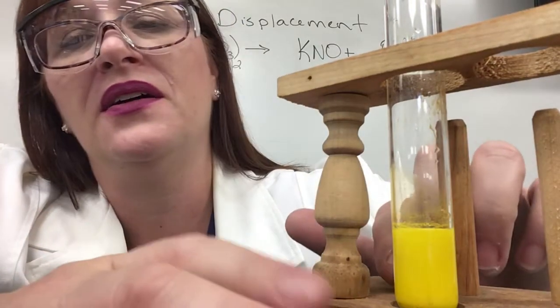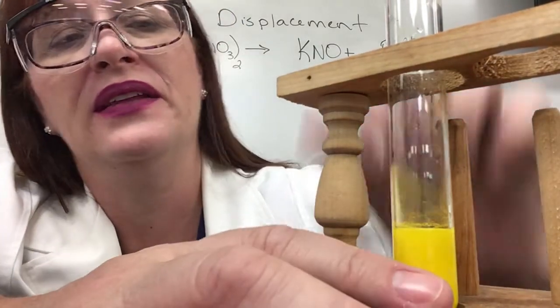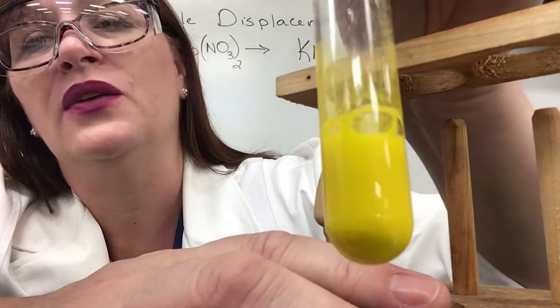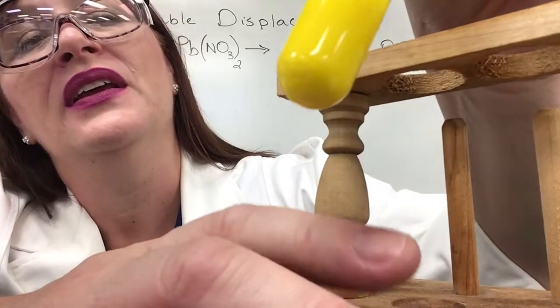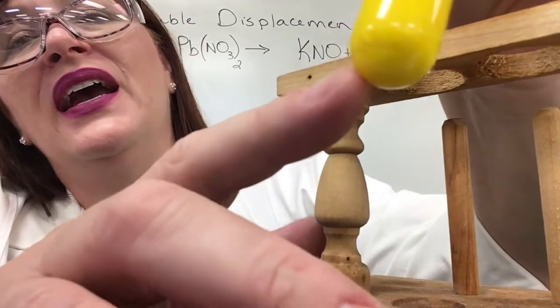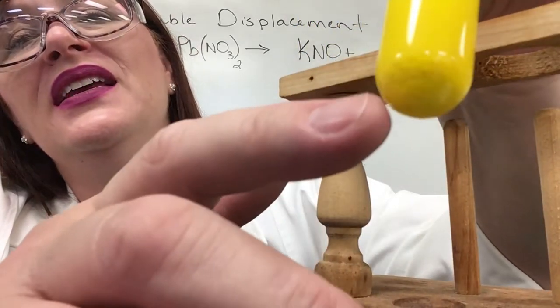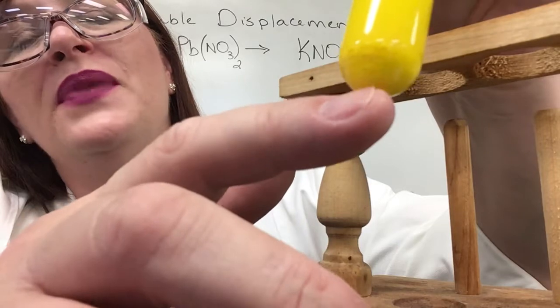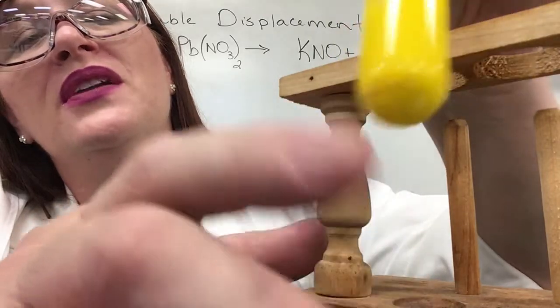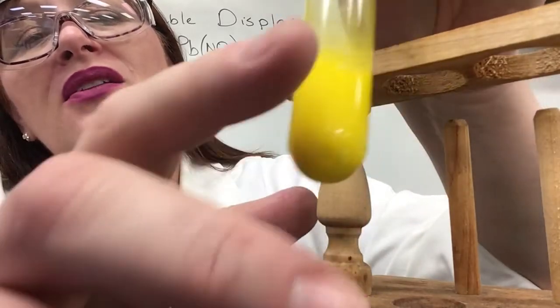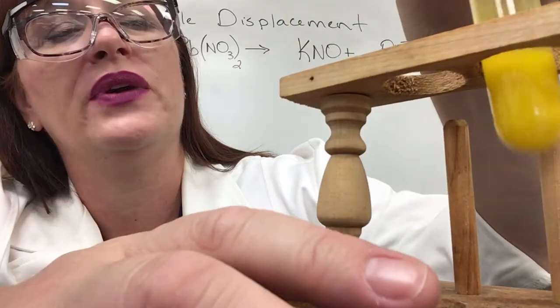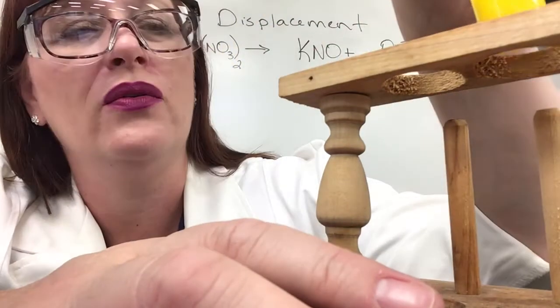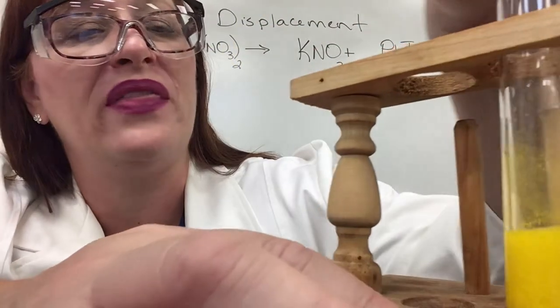If I wait a little while something pretty cool happens in this reaction. Right now it looks like it's all liquid — all of this looks like a liquid. I can kind of see little chunks of something at the bottom but by and large it just looks liquid. Kind of milky looking though, a little bit thick.